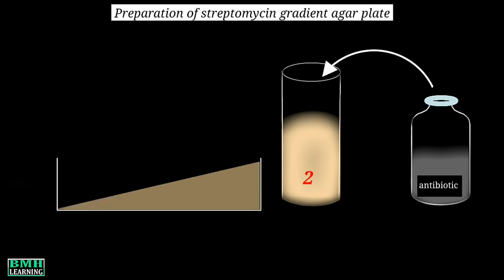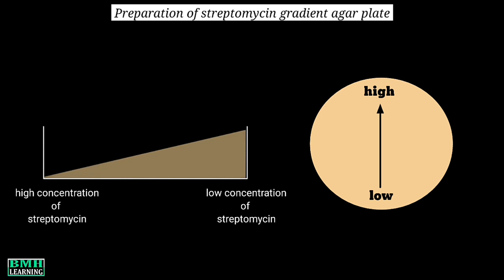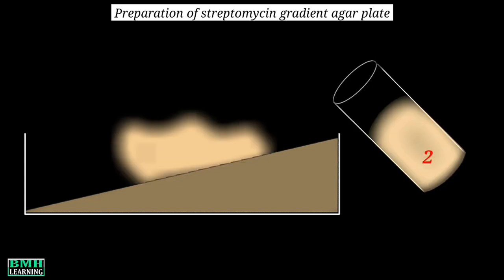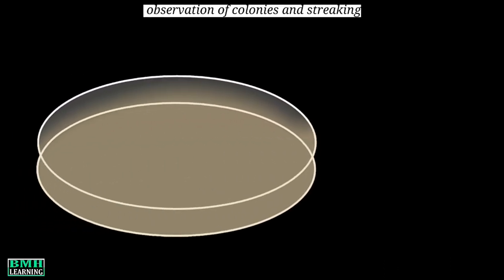The agar in the Petri plate is already solidified, so we remove the pencil and place the Petri dish horizontally. Before pouring the antibiotic agar, we mark both ends of the Petri plate: the end of the nutrient agar slope with high agar is marked as low streptomycin concentration, and the other end with low agar is marked as high streptomycin concentration. The molten agar medium containing streptomycin is then poured onto the plate so that it entirely covers the gradient agar layer, and the gel is kept to solidify.